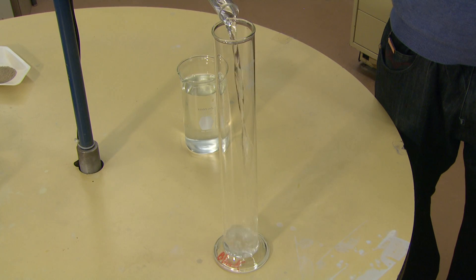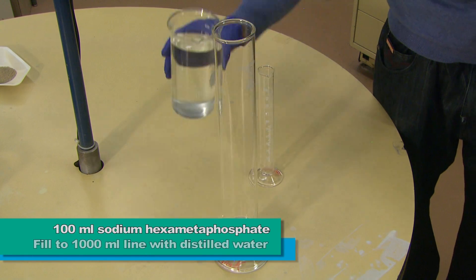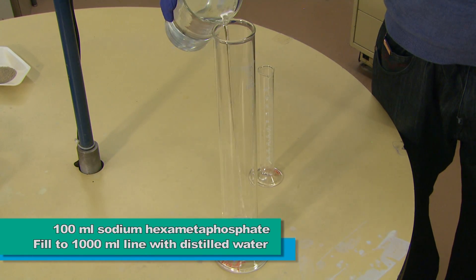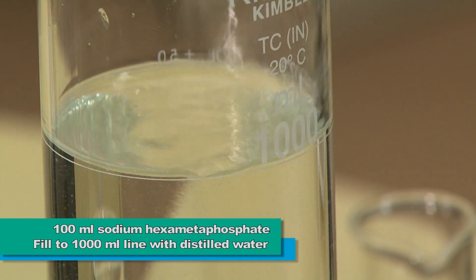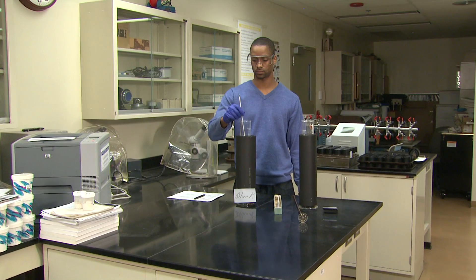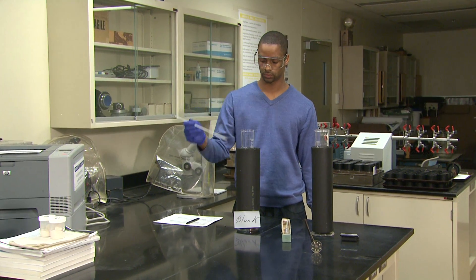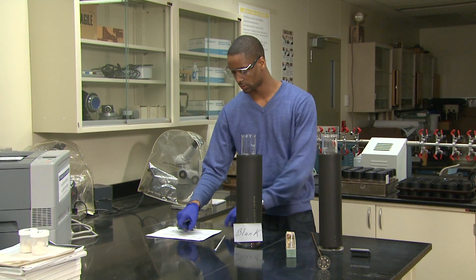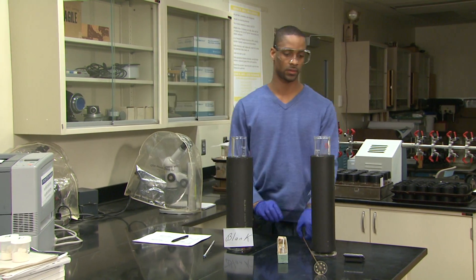A blank is also prepared at this time. This consists of adding 100 milliliters of a sodium hexametaphosphate solution to an empty cylinder, filling to the 1,000 milliliter line, then covering with an insulating sleeve. A blank measurement is necessary because dispersion added to each sample will yield a particular hydrometer reading which will need to be accounted for in the calculations. Any hydrometer reading changes in the blank will be due solely to temperature changes.